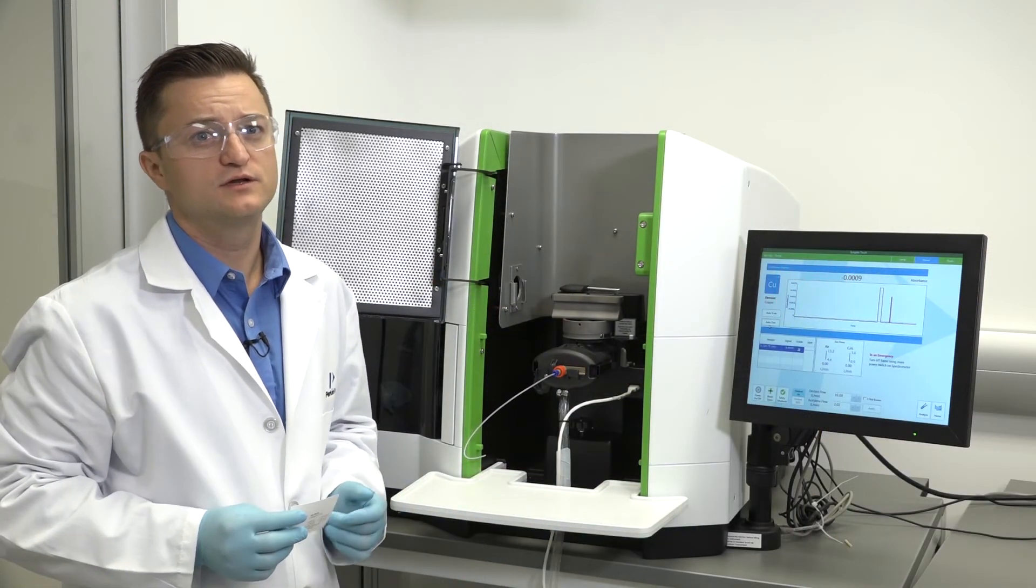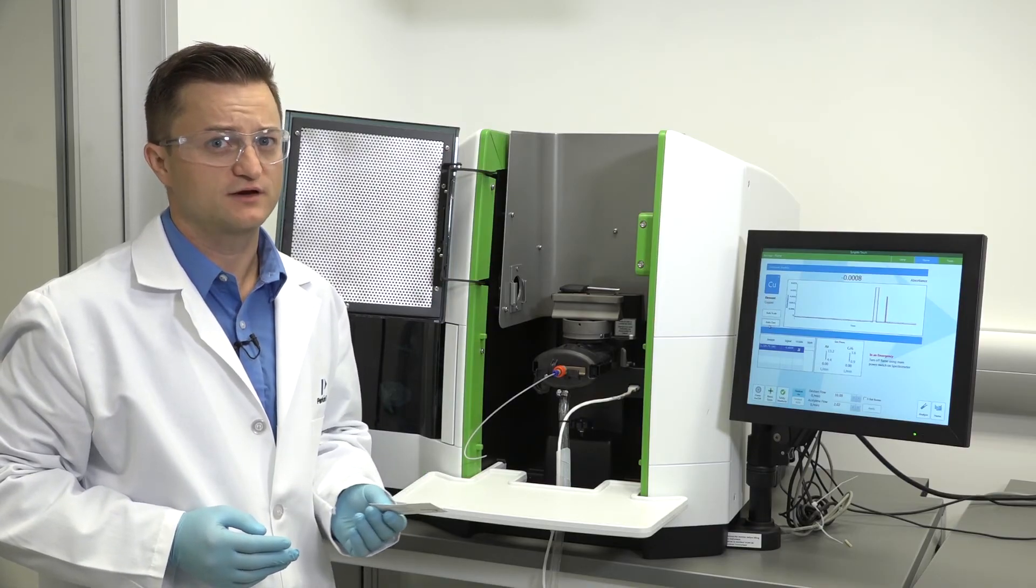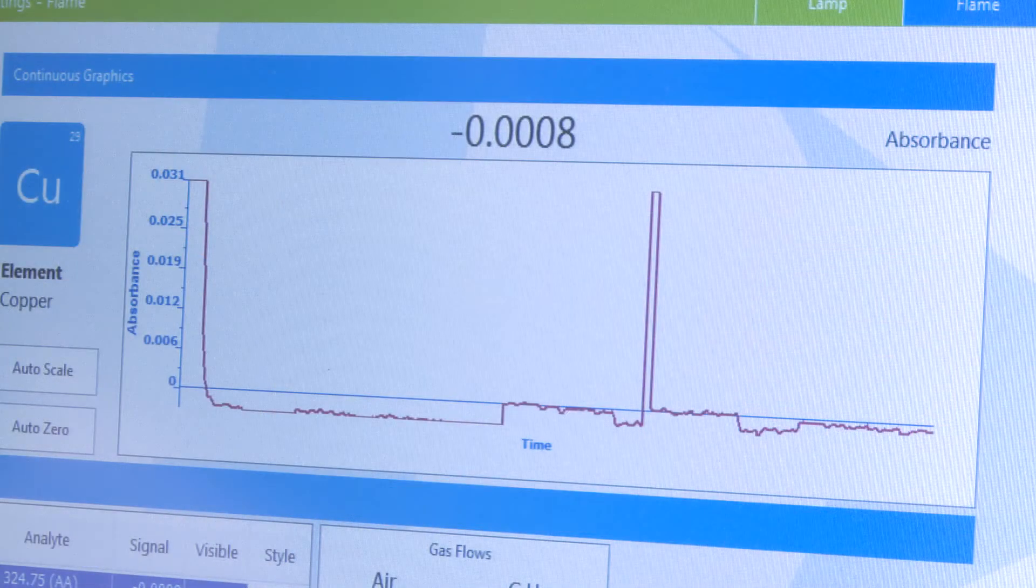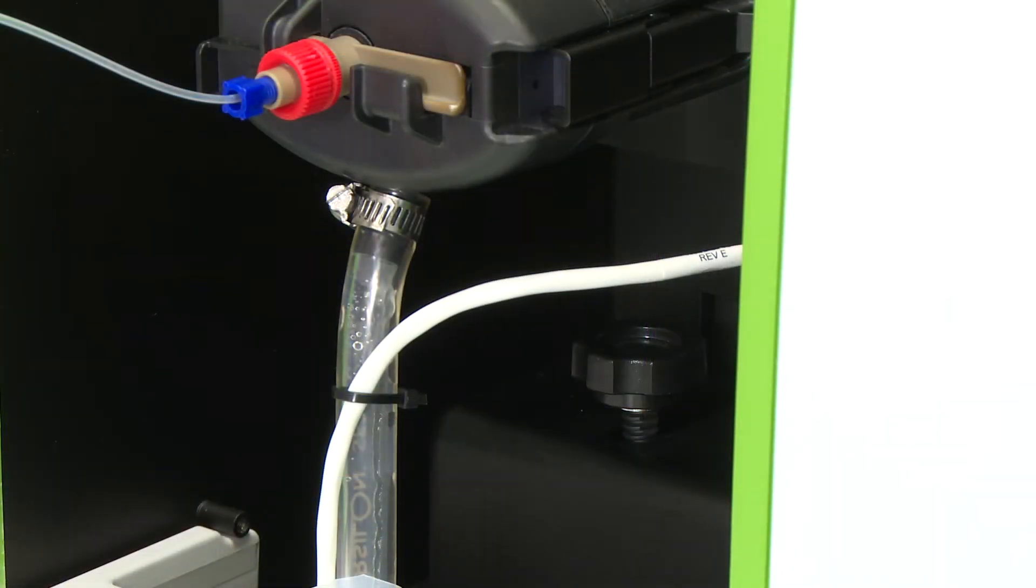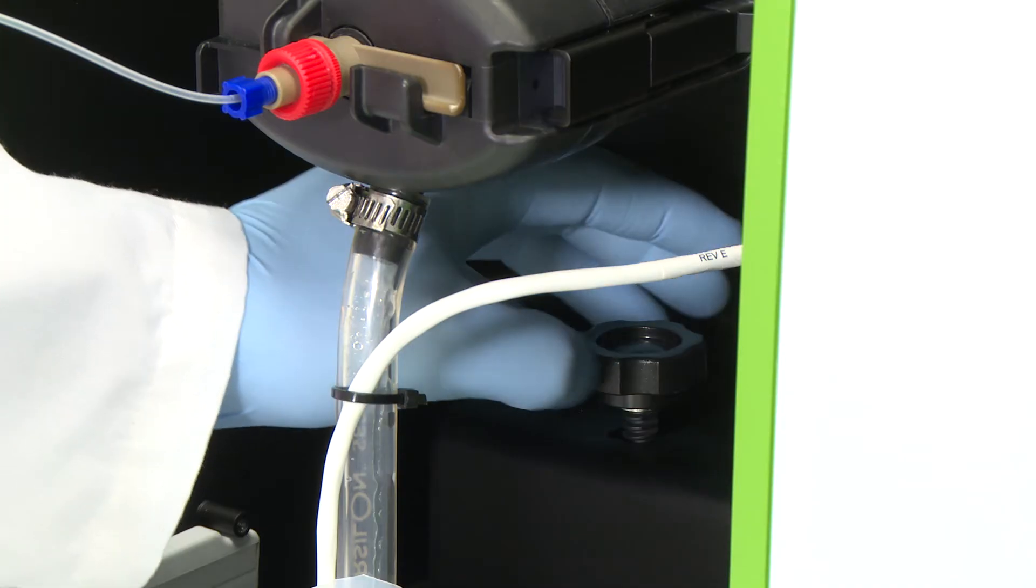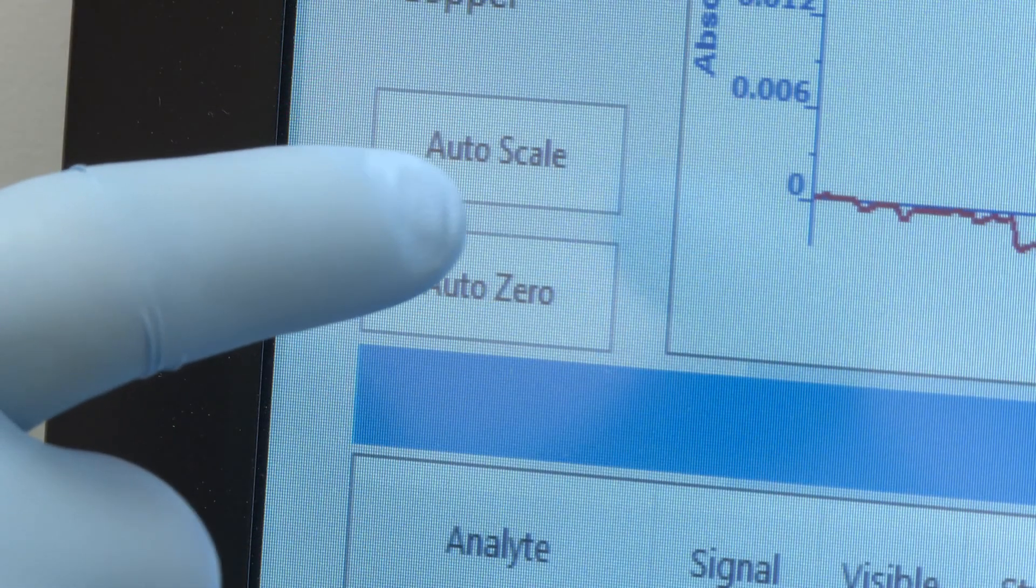Then, go to the spectrometer control and click on the continuous graphics. The continuous graphics window will appear. Lower the burner with the vertical alignment control so that the burner head is well below the radiation beam. Auto-zero the signal by clicking Auto-zero.